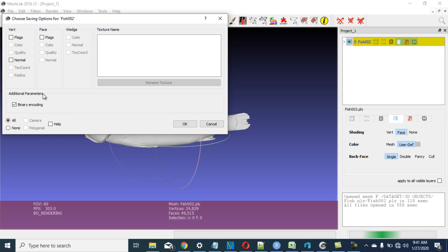So you may need to check to know, because this is where people always have problems when they are trying to digitize and the thing is not working. The application is not accepting their 3D image. What is going on? Some of them are already binary encoded. So you might need to remove the binary encoding so that you can be able to digitize. So that is that for now on this.